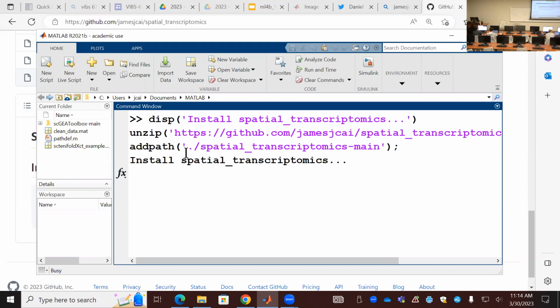Yeah, so if you don't switch to the right folder, it's fine. But you remember you installed under this folder. So what you can see, the folder and the current folder is here in this region. But we just do this one-time use, so it's fine if you install under the ICA examples. Any folder should work. But for later use, you probably want to install this side by side with another toolbox so you can keep using.